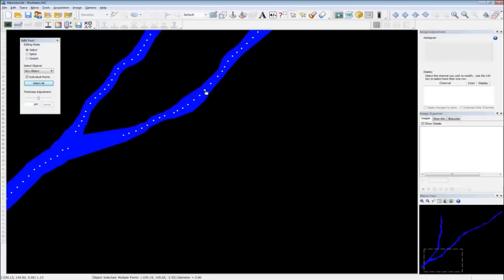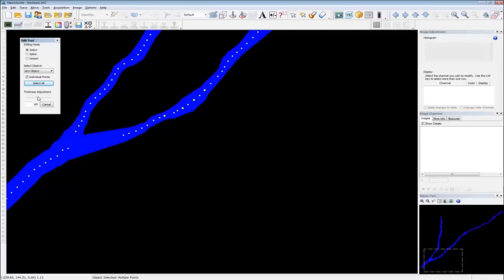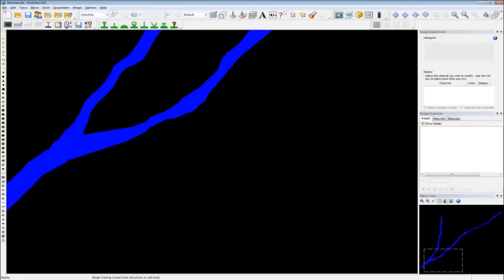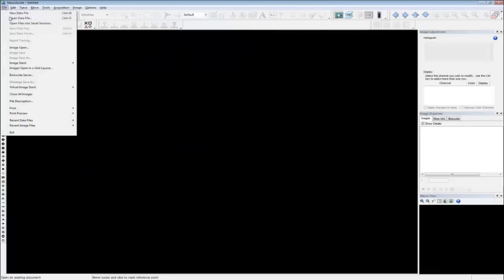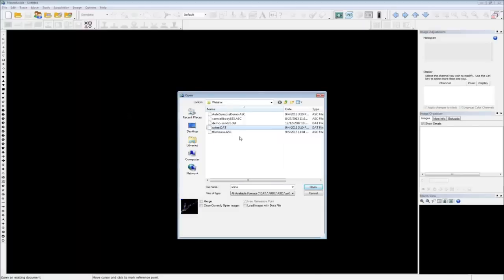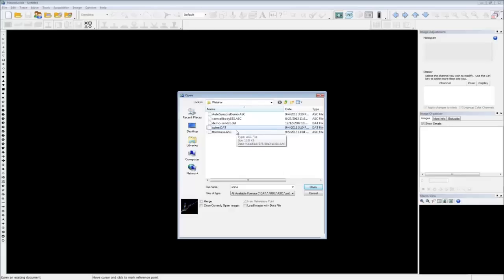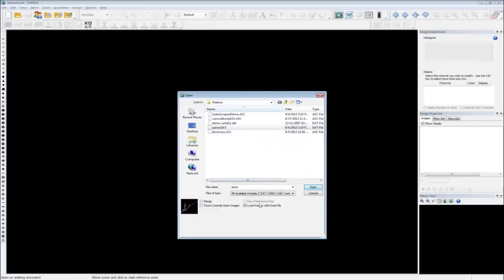There's a lot of flexibility to go back and modify thickness after tracing to make the exported images proper for your presentation. Now let's talk about transparency. If you're having difficulty visualizing image data underneath tracing data, go to Options > Display Preferences > View tab. This is where you can also display thickness — but here you can adjust the tracing transparency. Increasing transparency lets you start to see the image data underneath, which is especially helpful when manually tracing a dendrite with thickness to make sure you're mapping it properly.